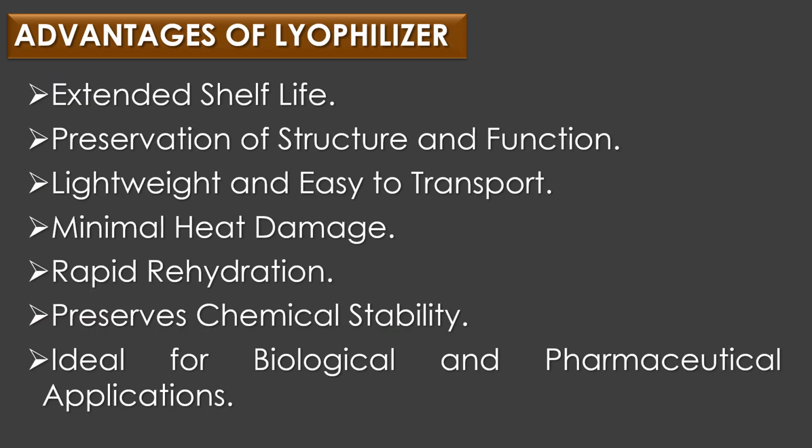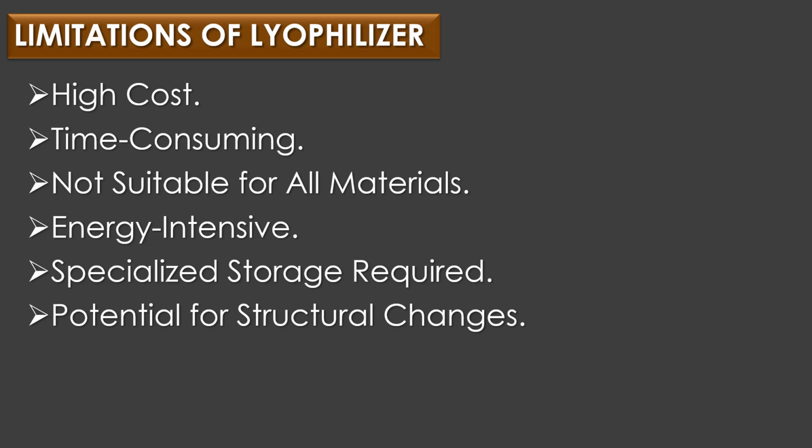Advantages of lyophilizer. The advantages of lyophilizer includes extended shelf life, preservation of structure and function, lightweight and easy to transport, minimal heat damage, rapid rehydration, preserves chemical stability, and ideal for biological and pharmaceutical applications. Limitations of lyophilizer. The limitations of lyophilizers includes high cost, time consuming, not suitable for all materials, energy intensive, specialized storage required, and potential for structural changes.